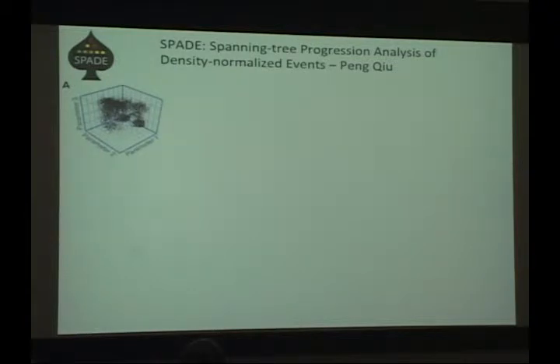The basic idea here, sort of visualizing 3 dimensions of data, is that you have a cluster of data in 3 parameters, and you can see there's some sort of dense regions of the data and some really sparse regions of the data.